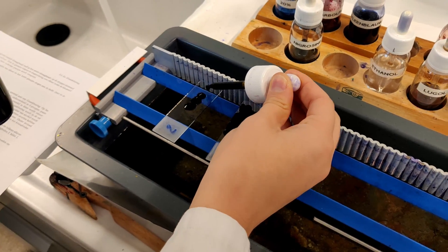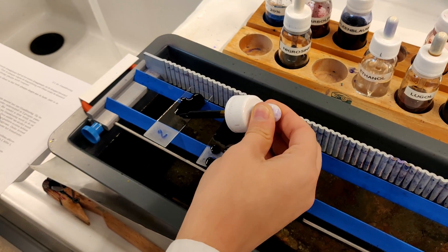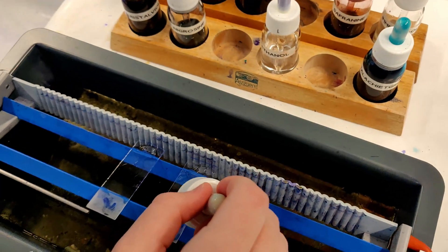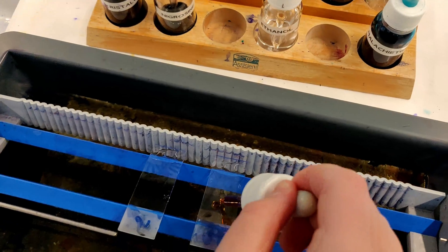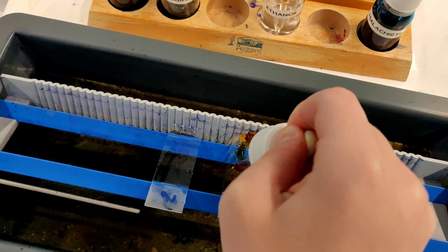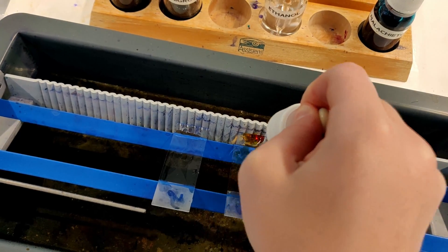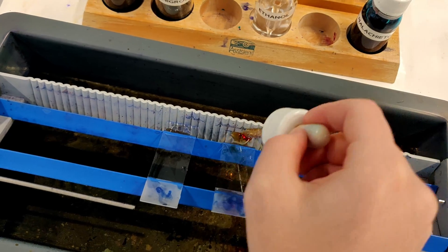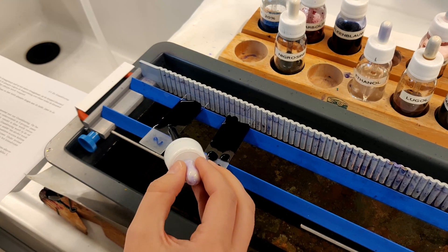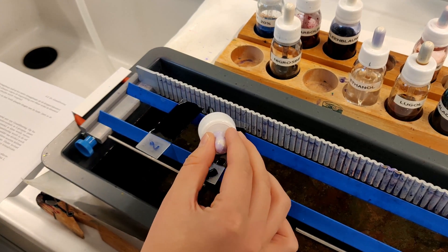Now you add the crystal violet stain. After the excess stain is washed off, we apply a binding agent like an iodine solution which contains iodide ions. The iodide complexes with the positively charged crystal violet molecules trapped inside the cells. The crystal violet-iodide complex is now held more strongly within the cell wall. The thicker the cell wall, the more crystal violet-iodide molecules are held. Next we add the decolorizer, ethanol, for a precise time interval, which removes loosely bound crystal violet and crystal violet-iodide molecules.